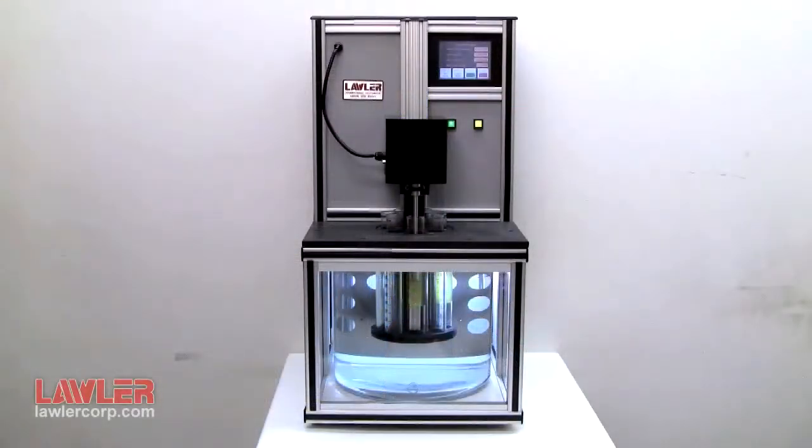The Lawler Model 305 has been designed from the ground up not only to perform the test precisely, but give years of trouble-free service.